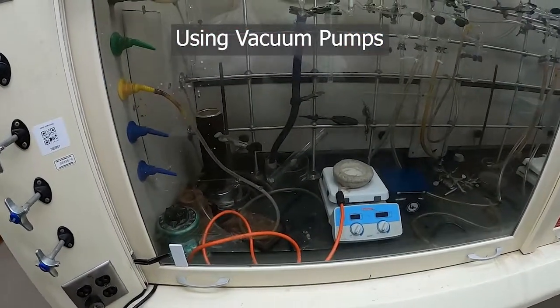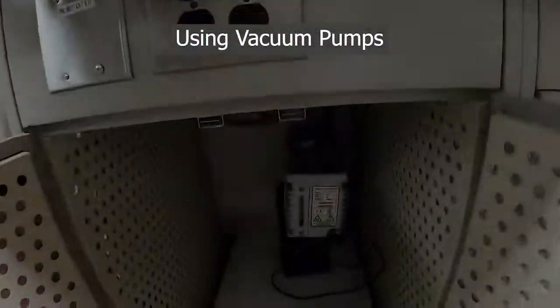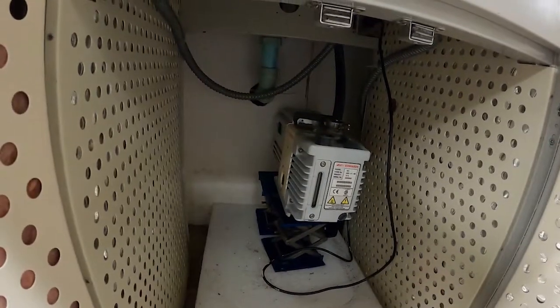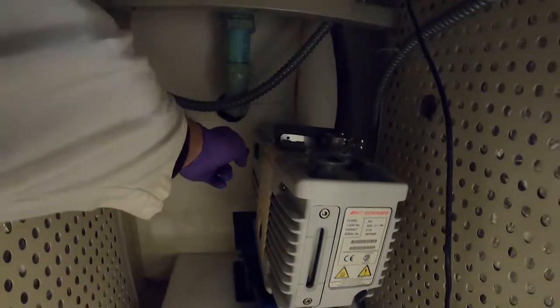The vacuum pump for this hood is located here underneath in this cabinet. And the switch to turn it on is here on the side.